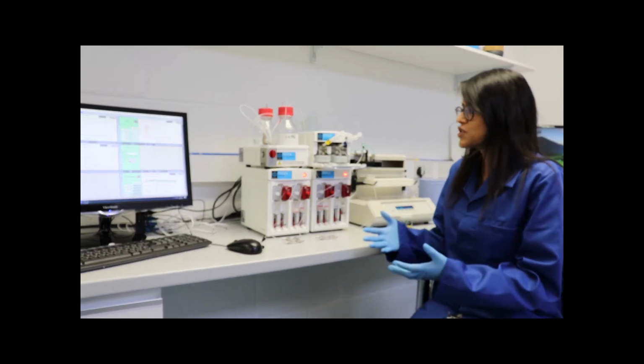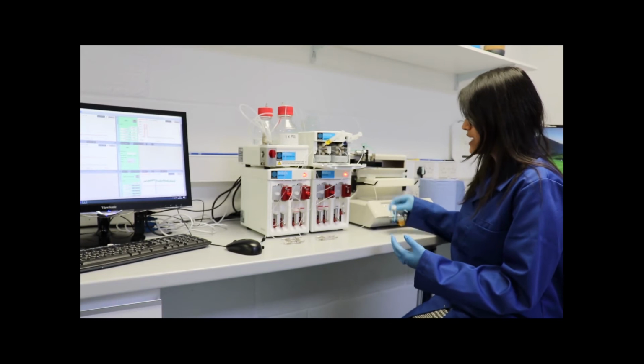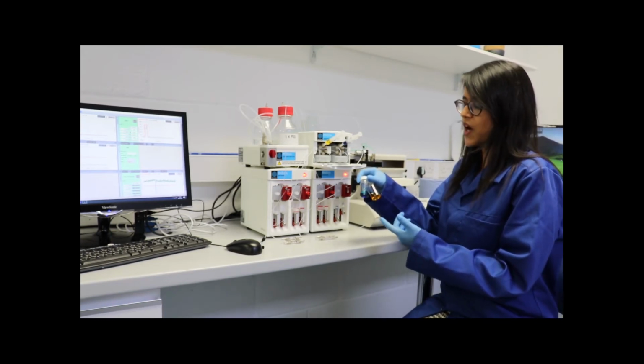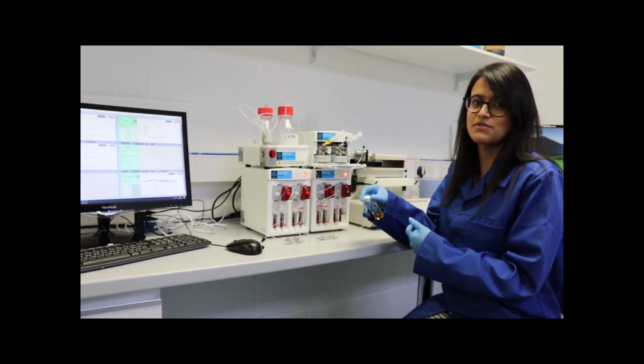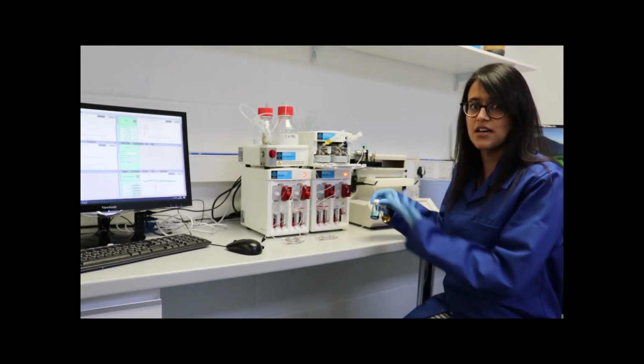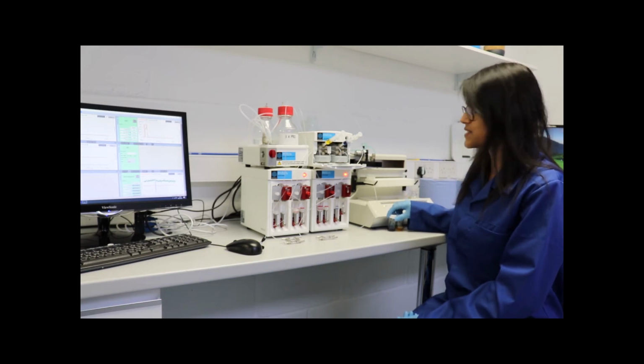For today's demonstration purposes, I'm using 2 dyes. These are just basic food dyes. We've got the blue one and the yellow one. So once we mix them together, we should get a nice green sample collected at the end.